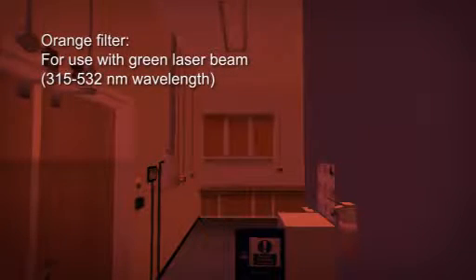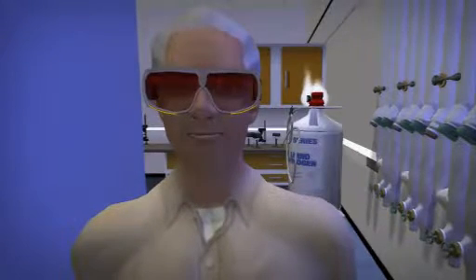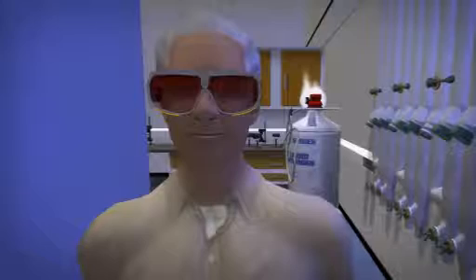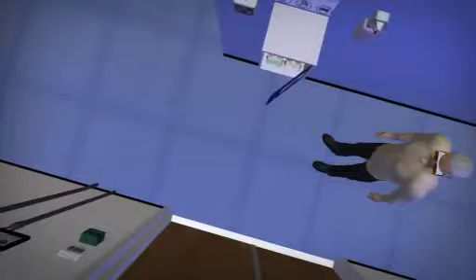It is important to remember that the correct goggles specified for the laser in use must be worn to prevent eye injury when lasers are operating. You should also remember to remove all reflective clothing, jewellery and objects that may be on your person before entering the main lab area.